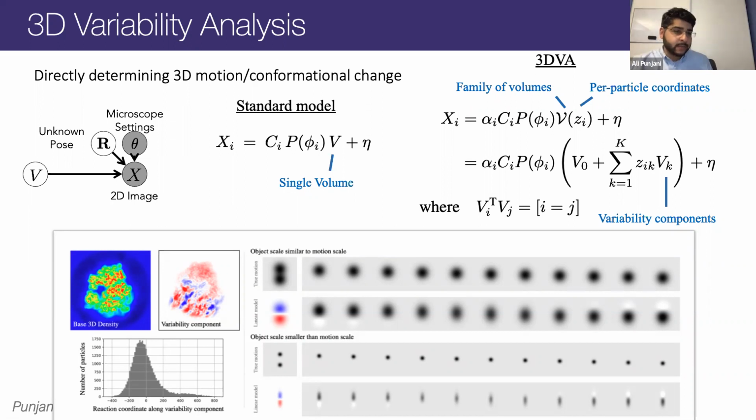That's something we need to explore a little more, including the validation of 3D variability components. If we read the paper, there's some information about that there, but knowing which variability components are significant relative to each other is something we need to investigate a little more.